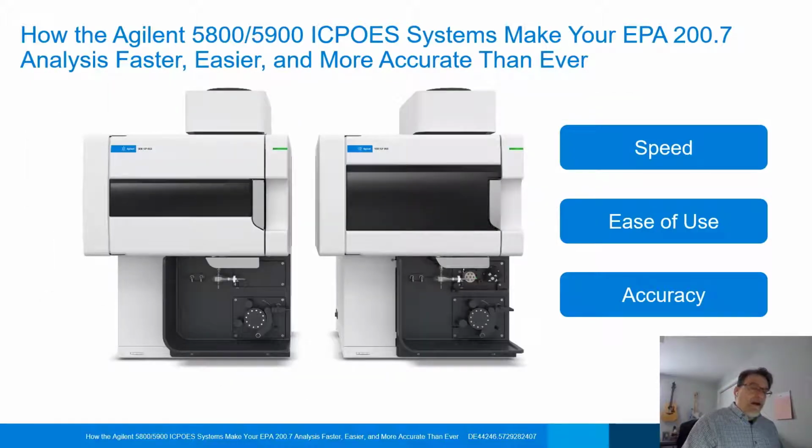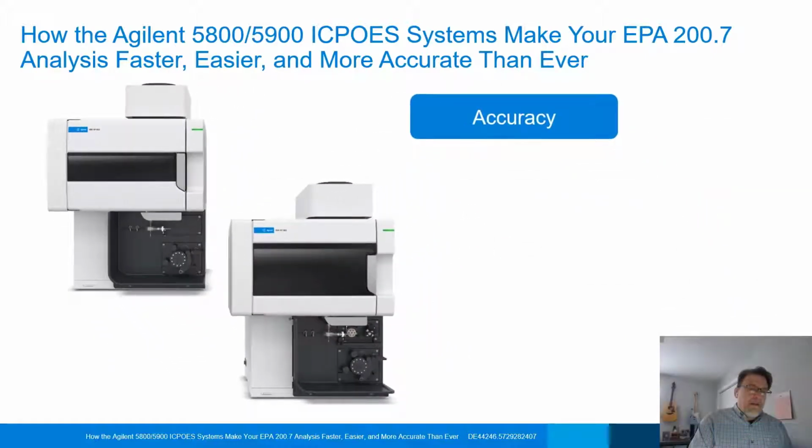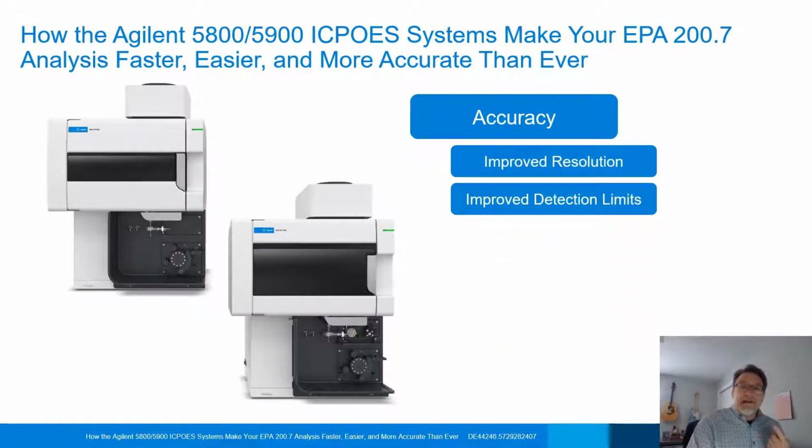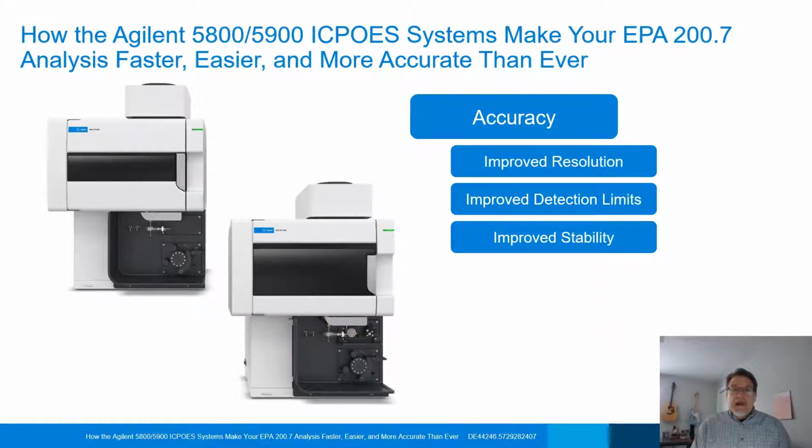So, moving on to the accuracy part of the equation, the accuracy part, as you may have guessed from my previous slides, will probably have three parts: improved resolution, improved detection limits, and improved stability.